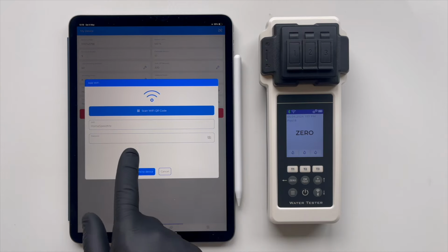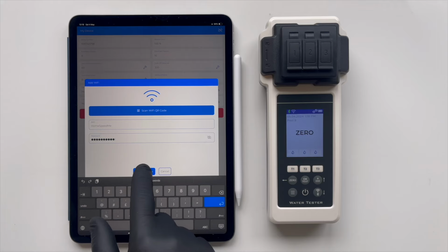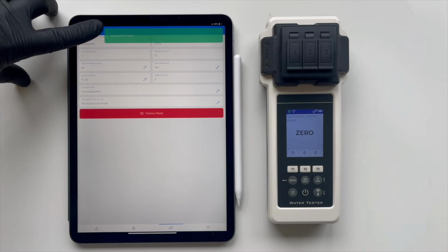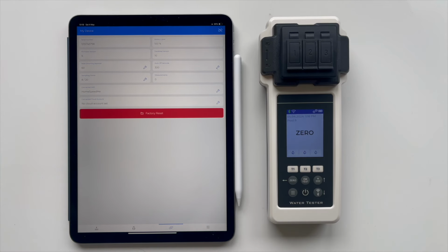Let's correct the password. If the credentials are correct and the network is within range, the tester will successfully connect, allowing it to communicate with external servers for data syncing, software updates, and more. Send to device again. We wait for the banner on the screen to disappear. The banner has vanished. The login and password have been saved on the tester.